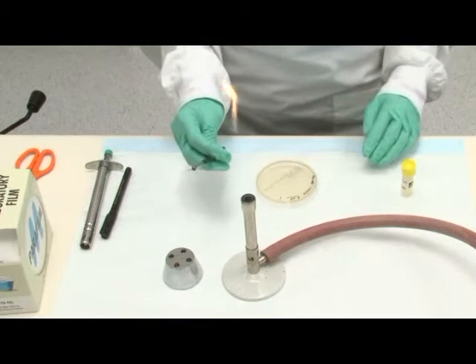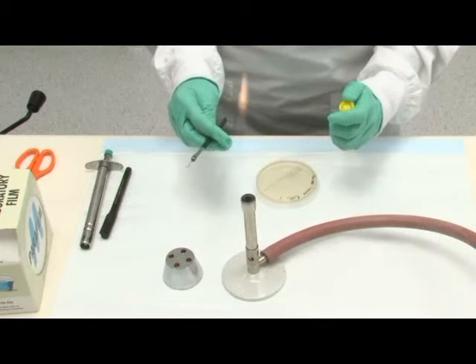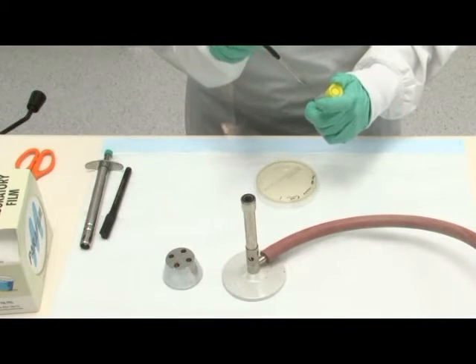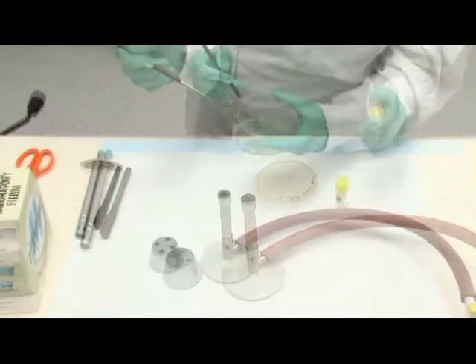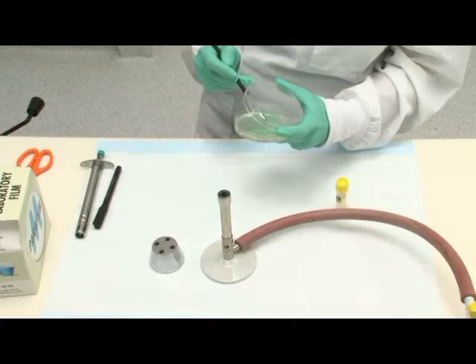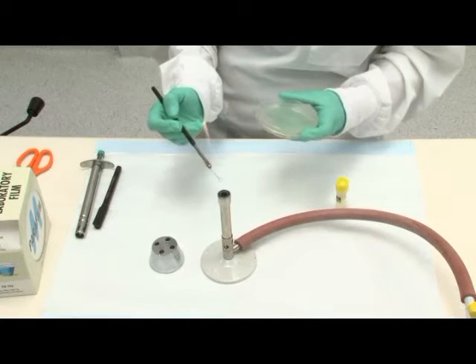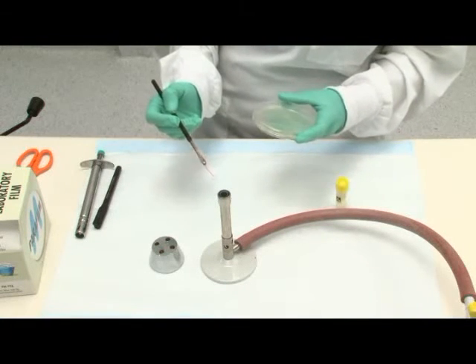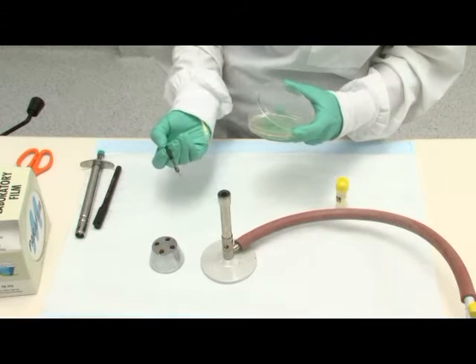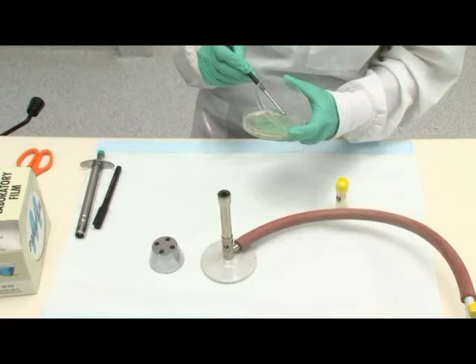Wait for the loop to cool and dip into the liquid culture. Inoculate your plate by placing a loopful onto the edge of the plate where it is marked. Flame and cool your loop. Once it has cooled, streak the first quadrant by drawing 4 streaks through the original sample.